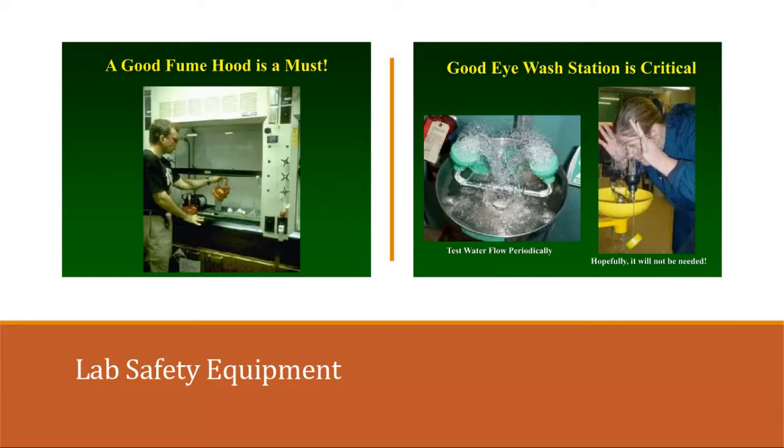So lab safety: good fume hoods and good eye wash stations. A good fume hood helps protect you from any of the reactions that chemicals may have. Of course, you see that guy right there is not exactly wearing a long sleeve shirt, so that's a no-no, right?